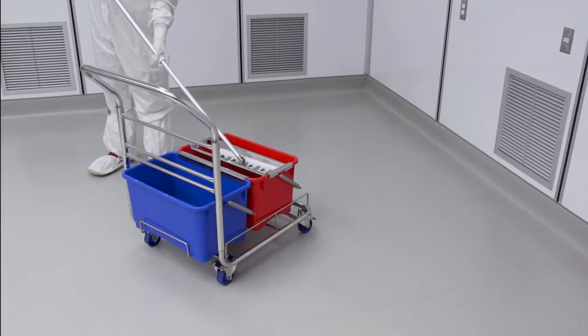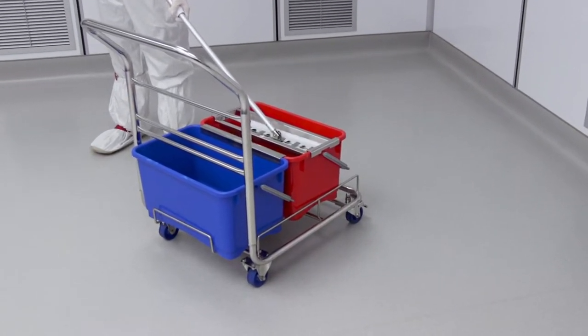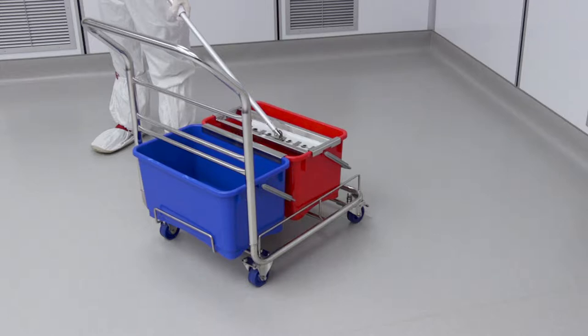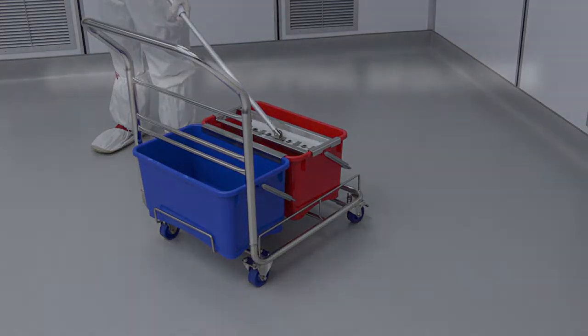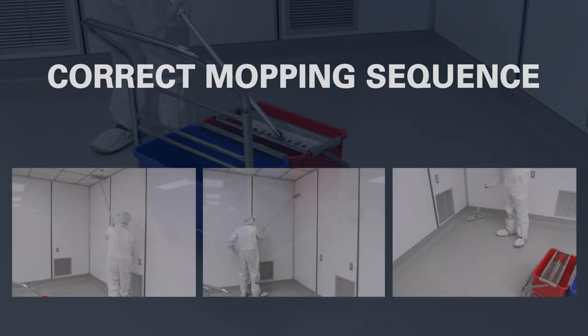We will demonstrate mopping walls and floors using the EasyCurve mop with a two-bucket system, fitted with a contact curved stainless steel sieve. The correct sequence is to mop the ceiling, then the walls, followed by the floor.